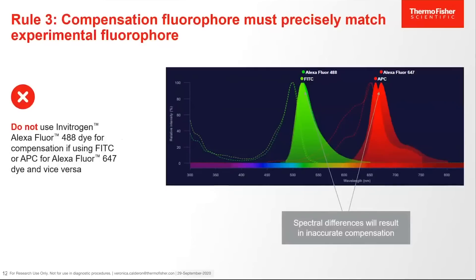Rule 3: compensation fluorophore must precisely match the experimental fluorophore. For example, do not use Alexa Fluor 488 dye for compensation if using FITC in your experimental sample. Or do not use APC for compensation if using Alexa Fluor 647 in your experimental sample, and vice versa. Spectral differences, though sometimes minimal, will result in inaccurate compensation.